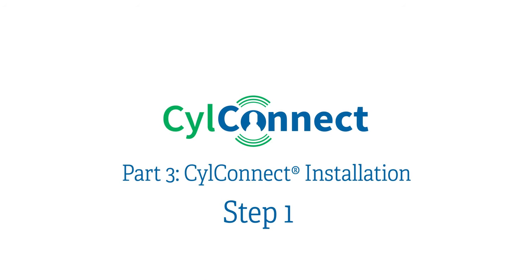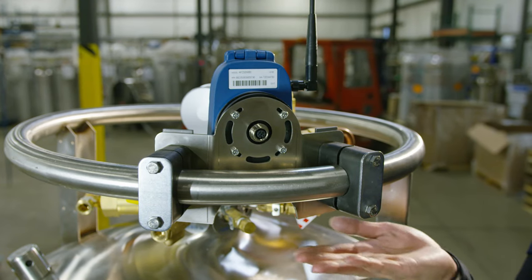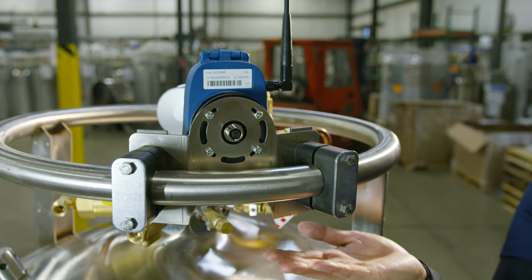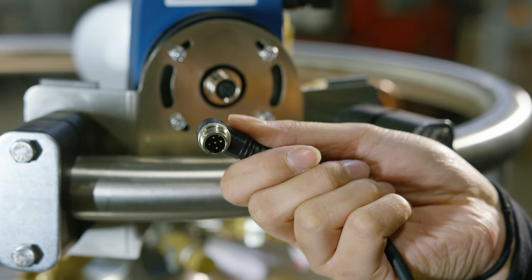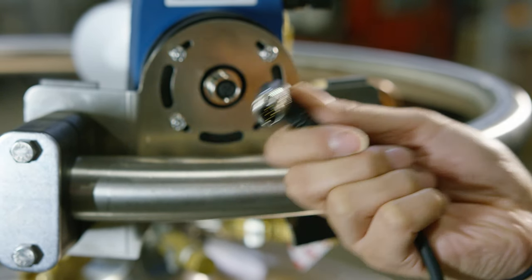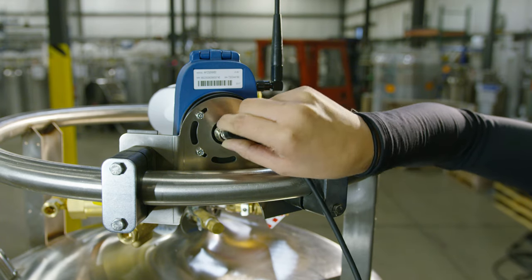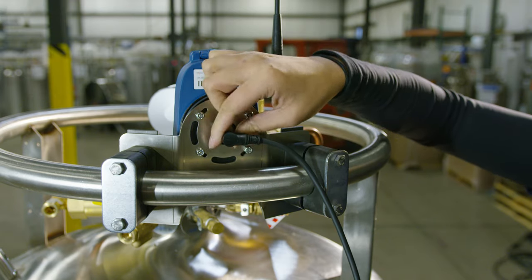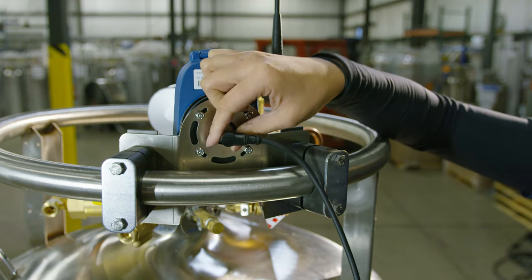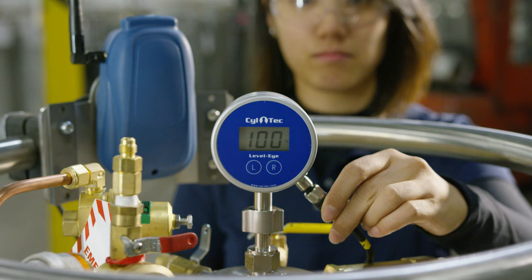Part three: SilConnect installation. Step one: using soft clamps, install the SilConnect uplink to the handling ring of the tank. Connect the Y cable to the SilConnect unit. The Y cable has a 90 degree connection with male pins that will connect to the back of the uplink. While connecting, make sure that the pins are fully engaged, then push and twist. Insert the cable marked A to the Level-Eye head.